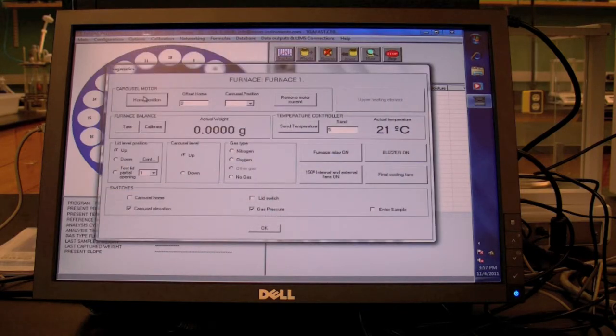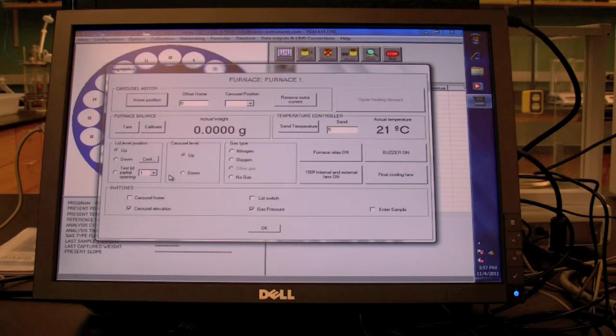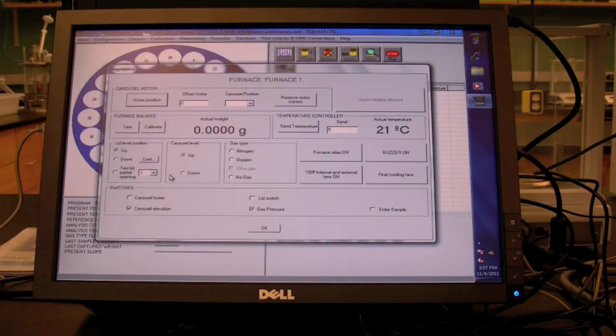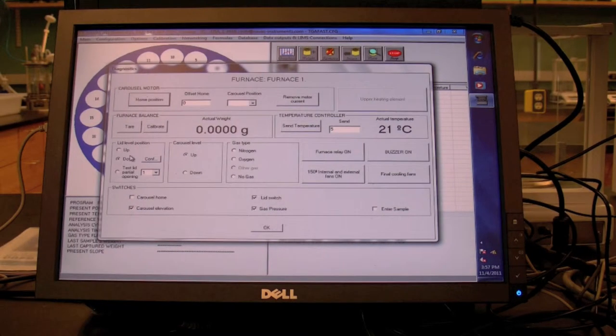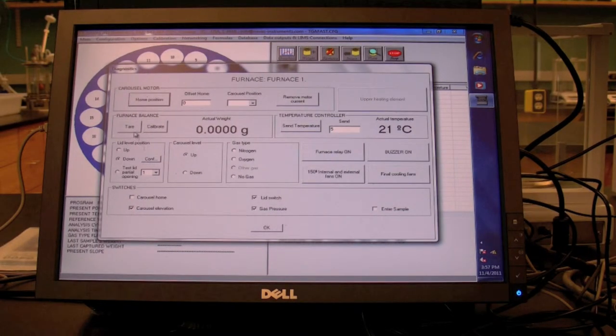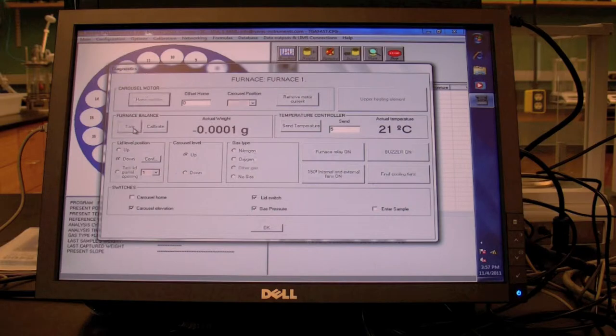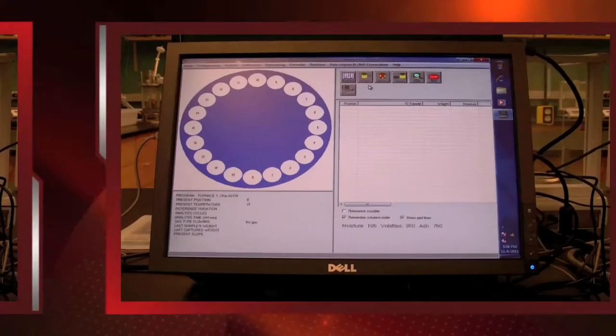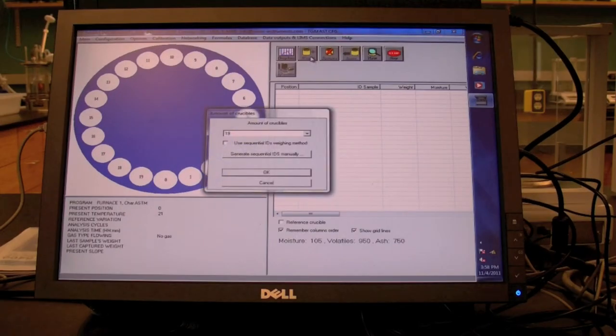The diagnostics window will pop up. Without any crucibles in the carousel, click down. Once the lid is closed, click the tare button to zero out the scale. Next, click on the weigh icon.